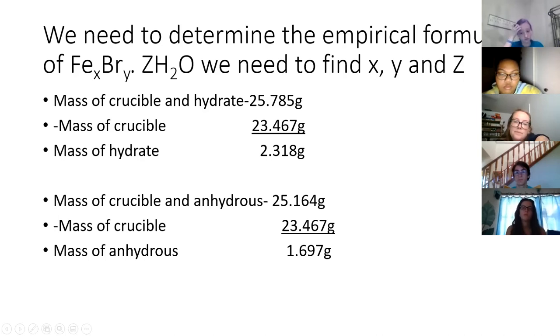Now, Taylor, what does the anhydrous consist of? The salts in the solution? Nope, not the salt in the solution. Maria, I have the anhydrous weight. What does the anhydrous weight consist of? The amount of water lost. Nope. I can get the amount of water lost by subtracting the anhydrous weight from the weight of the hydrate. That's part of what I did already. But what is the anhydrous? What did I say the anhydrous was composed of?